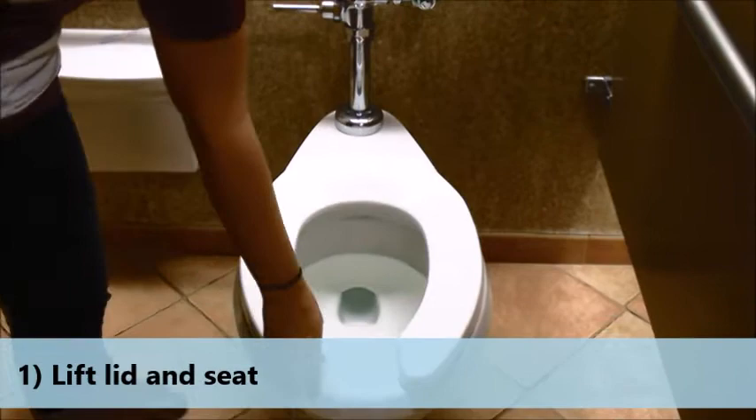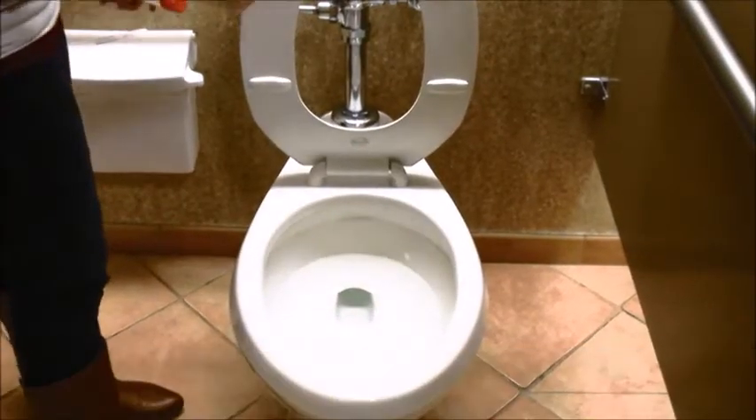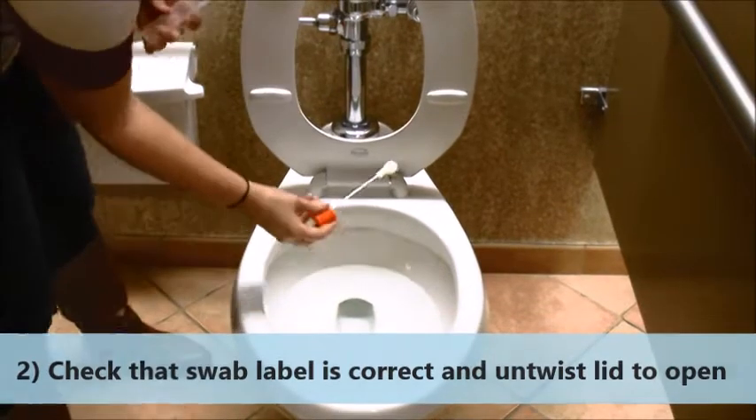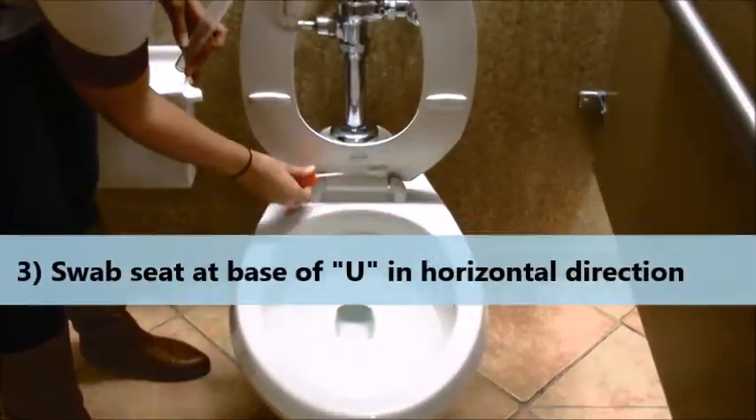First, lift the toilet lid and the toilet seat. Check that the swab label is correct for the swabbing location and untwist the lid to open.